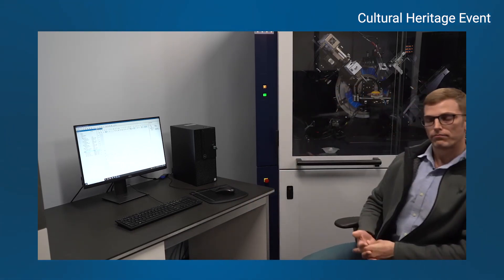So yeah, that's XRD for cultural artifacts. We're looking at small features of interest and as you can see, it's pretty straightforward. So yeah, thanks for joining.